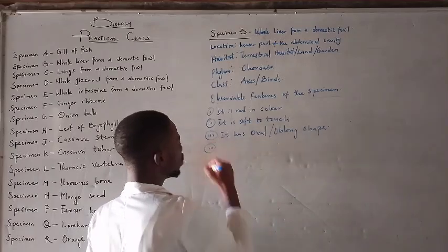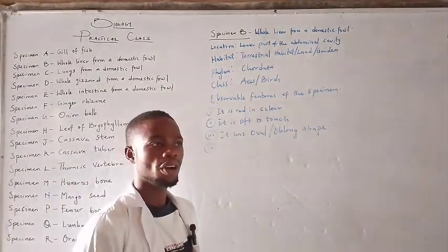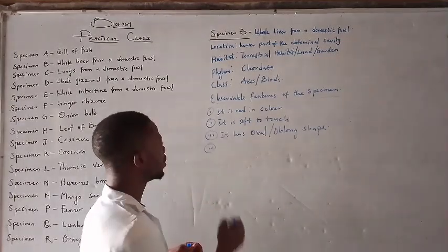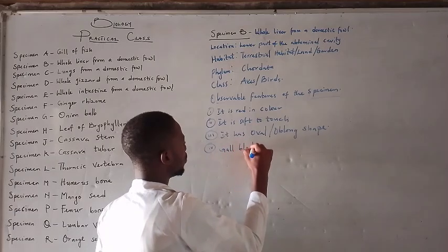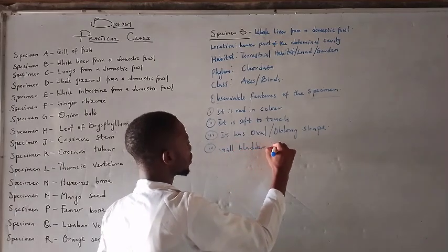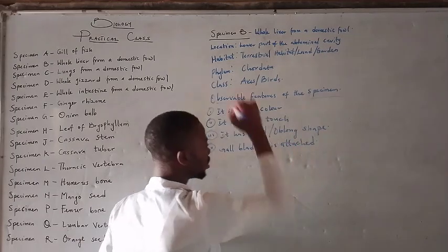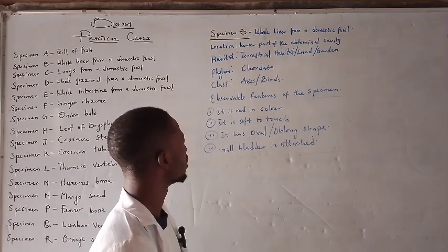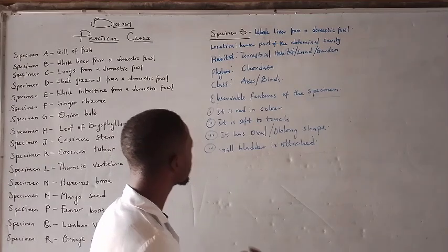Now, we are told that the liver that we should prepare should have an attachment of gallbladder. So you can include it. Gallbladder is attached. You can ask it, but now let's talk about biological significance.